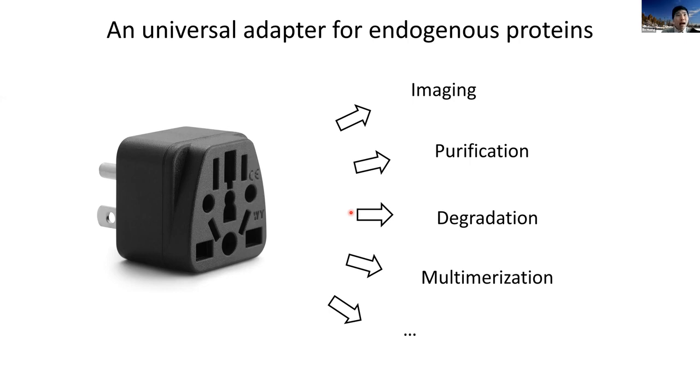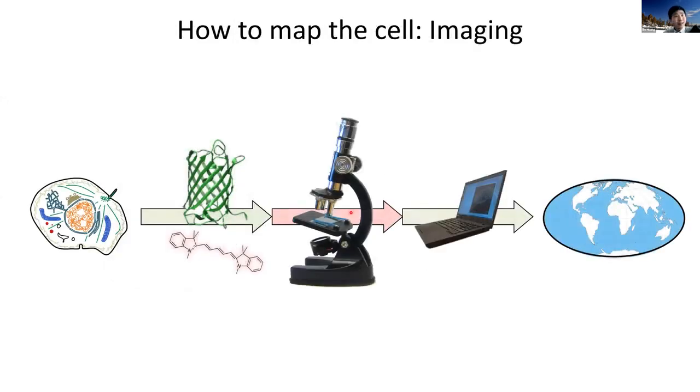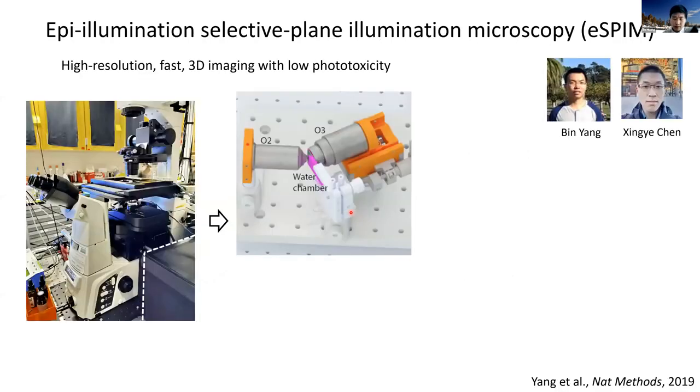Okay, so in the last few minutes, I'm going to switch gears and very quickly talk about some of our efforts on the imaging side. As I mentioned, whenever we switch to endogenously tagged proteins, the signal is much, much weaker, and we're suffering a lot from photobleaching during live imaging. Yes, the OpenCell images are mostly confocal snapshots instead of long movies. There are definitely some movies though.